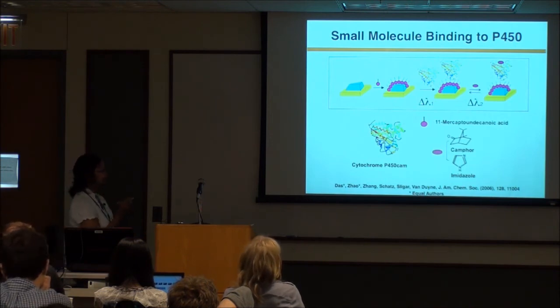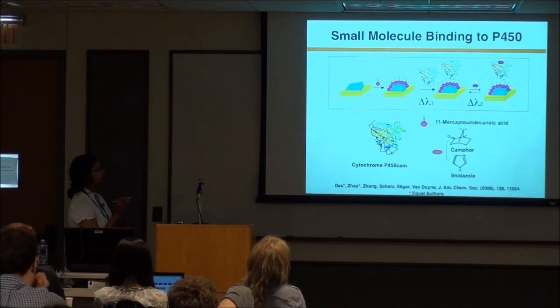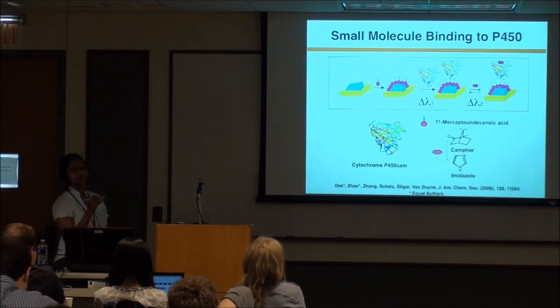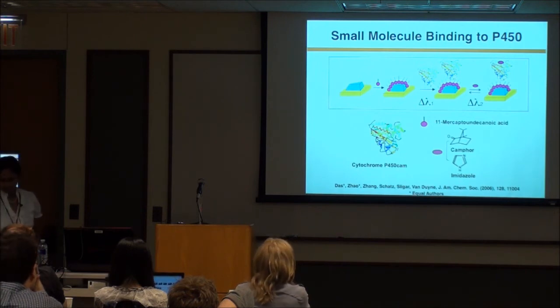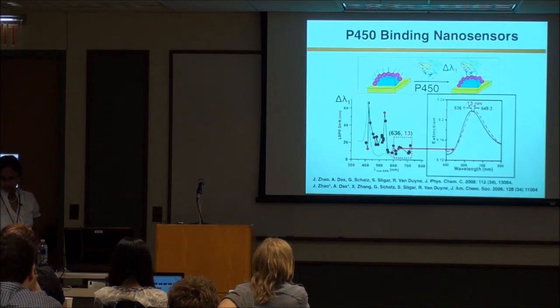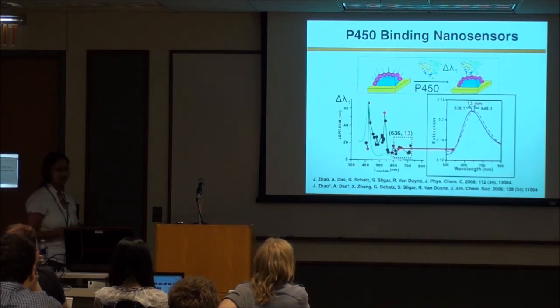And then we bound drug molecules. Here is basically a test compound, because this is a test protein: camphor and imidazole. And the protein we were studying is cytochrome P450 cam. So we see a very similar phenomenon.